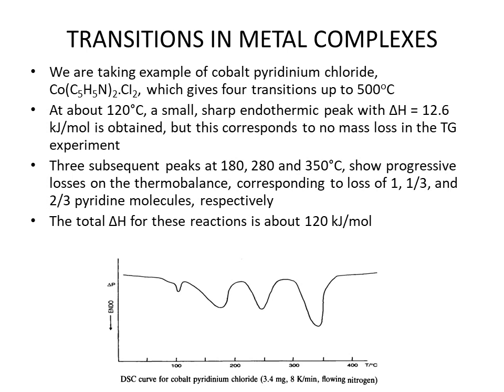But this corresponds to no mass loss, meaning during this transition no mass loss was recorded, and this experiment was performed in a thermogravimetric experiment.